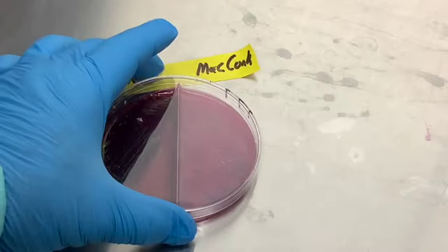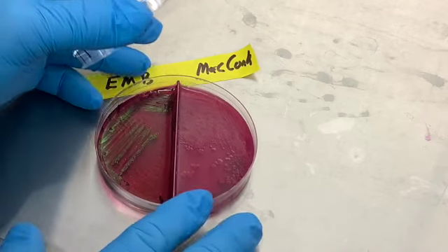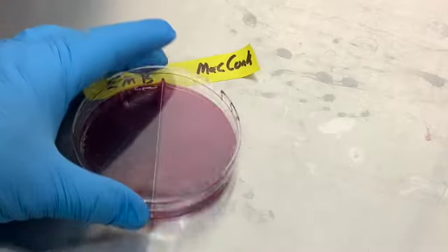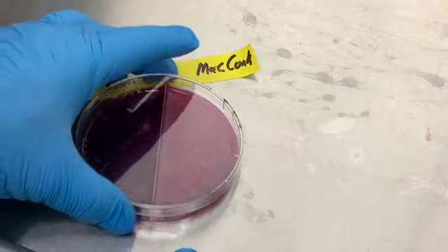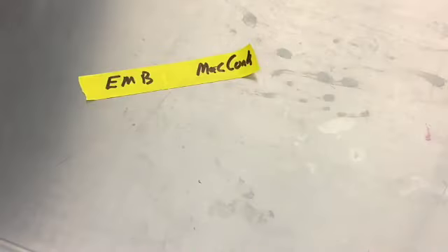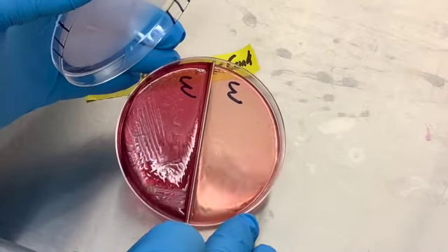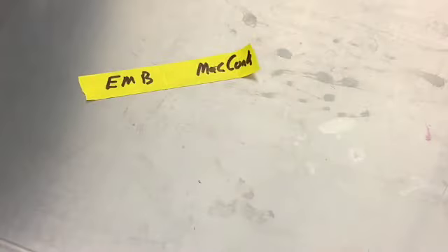Okay, this is number 1. Note the green metallic sheen on EMB, and then there are pink colonies on the other side. Okay, and this is number 3. So there's really no growth. Number 4.